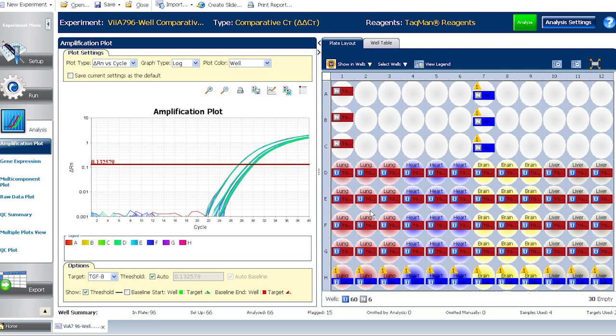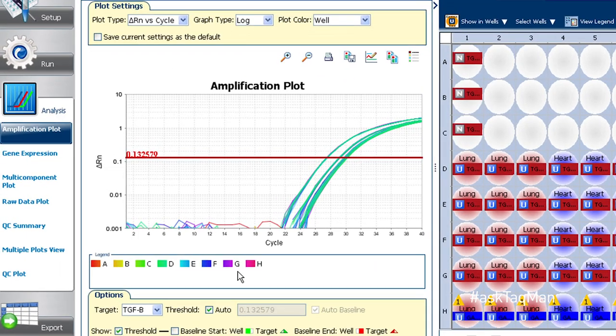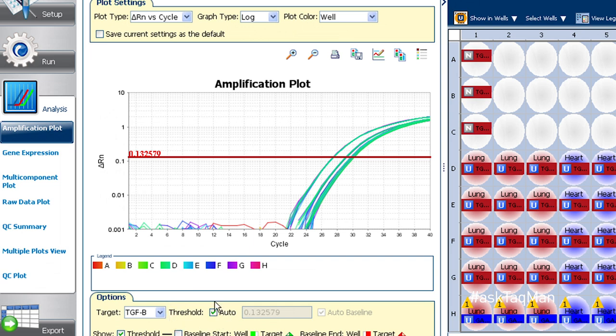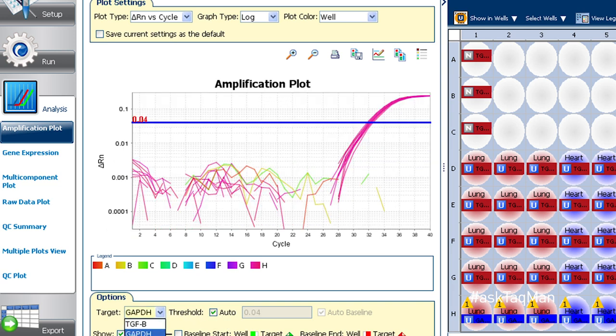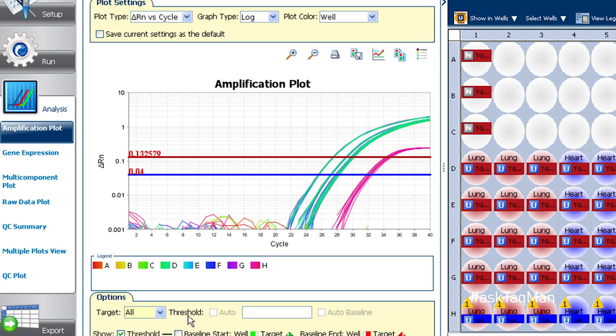The default on all Applied Biosystems real-time PCR software is auto-threshold, meaning the software sets thresholds for us the second we click analyze. Notice that it sets a different threshold for each assay separately, which is good since not all assays have the same sweet spot.